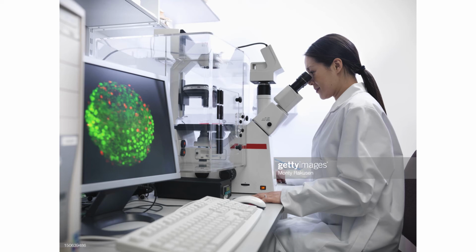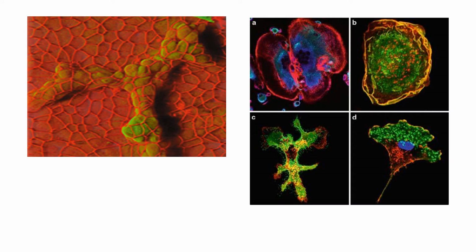Now, here we are getting a 3D image on the screen, all fluorescently colored and beautifully detailed, right? The other images can be 3D images, and the other images can be these, which are giving you the specific details about everything. If you see these things under a bright field microscope, forget about the minor details. You will not be able to see them unless you stain the specimen properly.